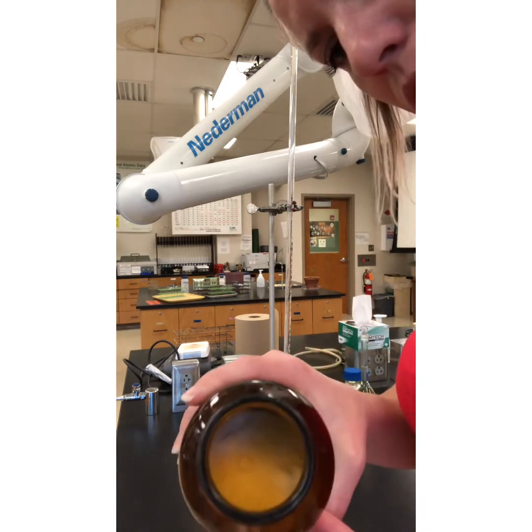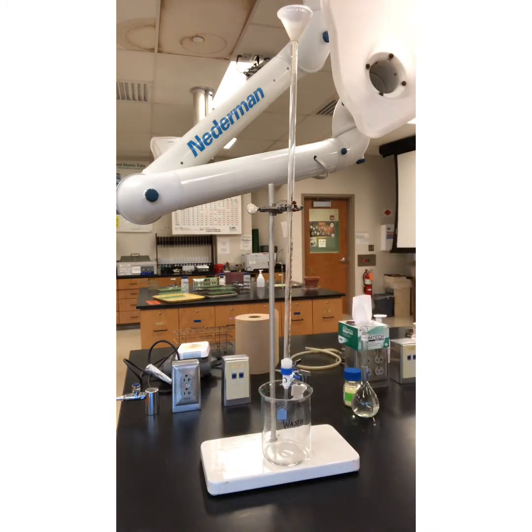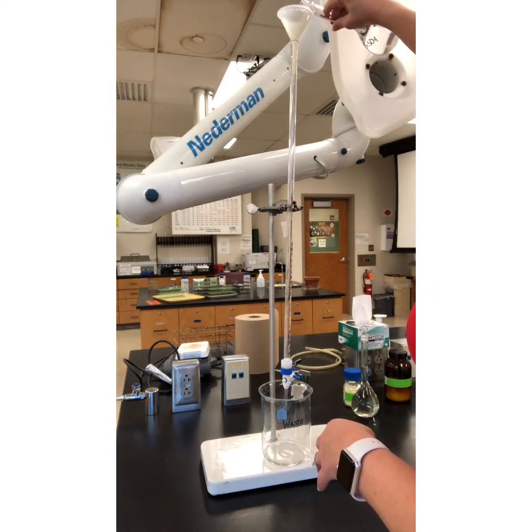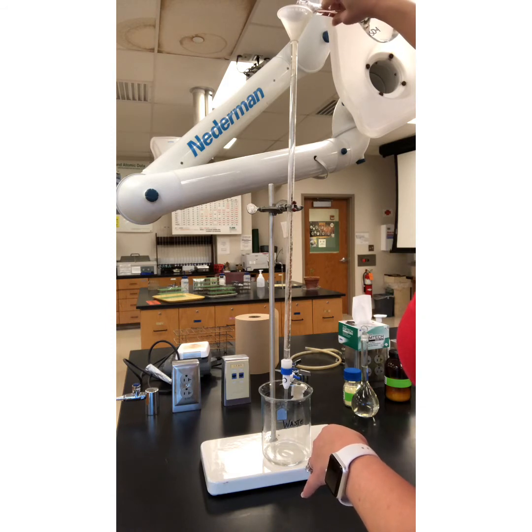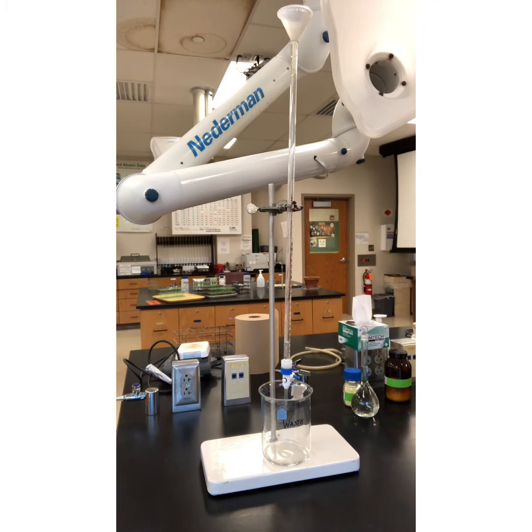Little white crystals for our zinc sulfate. Have to hydrate. Okay. Remove my glass stopper. Pour in my solution. Just a little bit, just a few milliliters. I don't want to waste it. In case I screw up on my titrations, I want to have plenty of my solution.